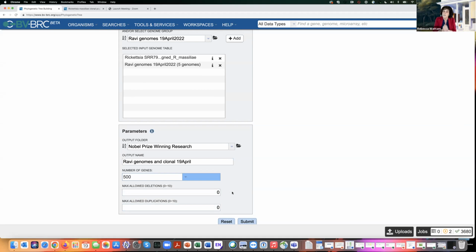This service, called the Codon Tree pipeline, looks for what we call perfect protein families. In this instance, it means a protein family that has one gene for each genome selected. So if there are 6 genomes here, each protein family would have 6 representatives, 1 from each genome. Those are the perfect families.